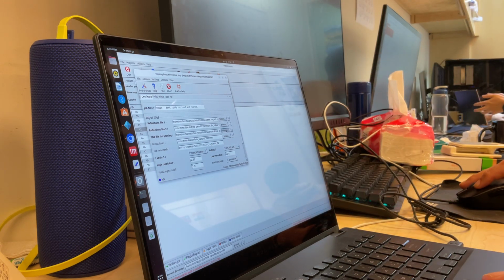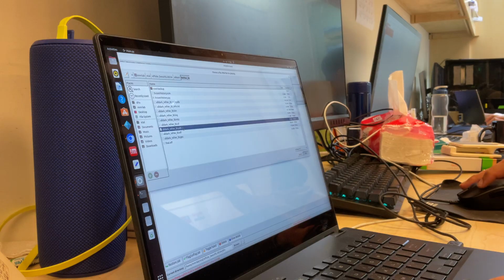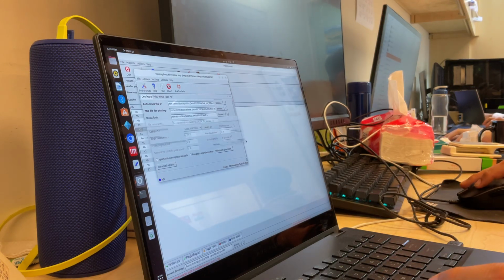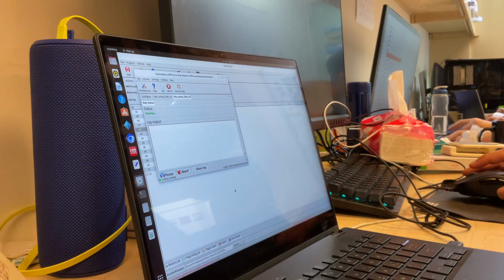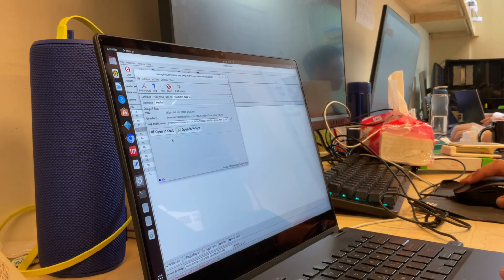And the last thing we need to do is take the final refinement. Non-H, doesn't matter. And so now we can run it. And no multi-scaling, because now we have scaled it ourselves much more accurately. So, run it. So this is your last map. This is your proper map.